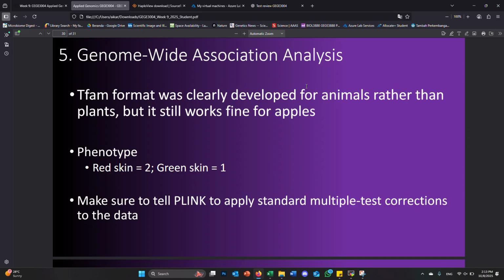So think of it almost like an optical illusion. If you look at two people standing right next to each other, there's no space between them, and then you walk around, and you see there's actually a huge gap between them. It was just the angle that you were looking at. And that's what happens when it comes to interpretation of MDS plots. You have to be careful. It most likely means they're fairly similar, but they may not be as similar as you think.